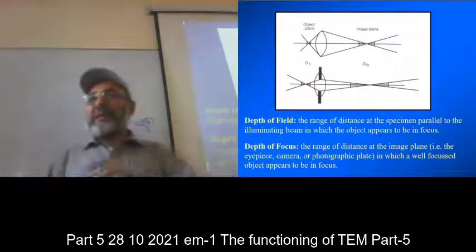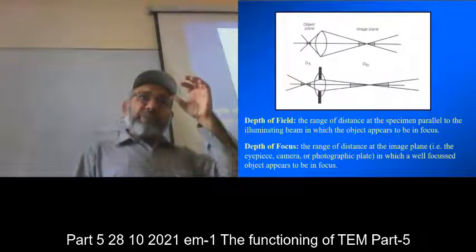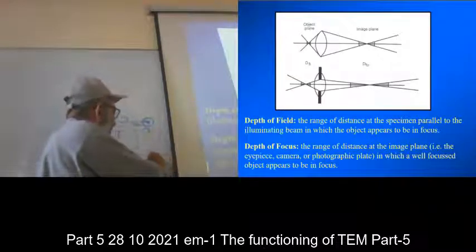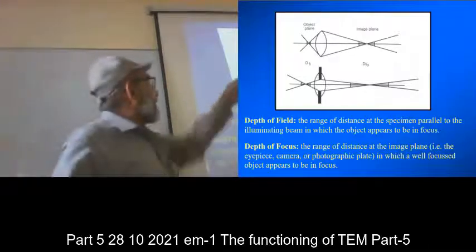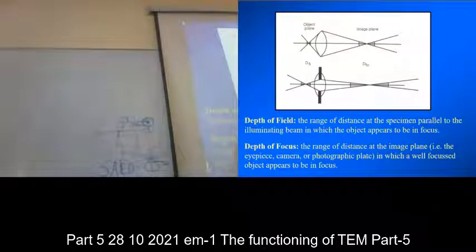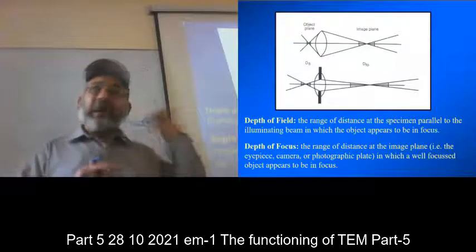And the benefit of electron microscopy is it has the depth of focus. So when you focus the beam, it is not a single plane which is in focus, but if there are depths and humps, they are equally in focus. And this is because of the depth of field. So instead of the perfect focus here, an area here and an area here are also in focus. In the electron microscope they are; in optical they are not.